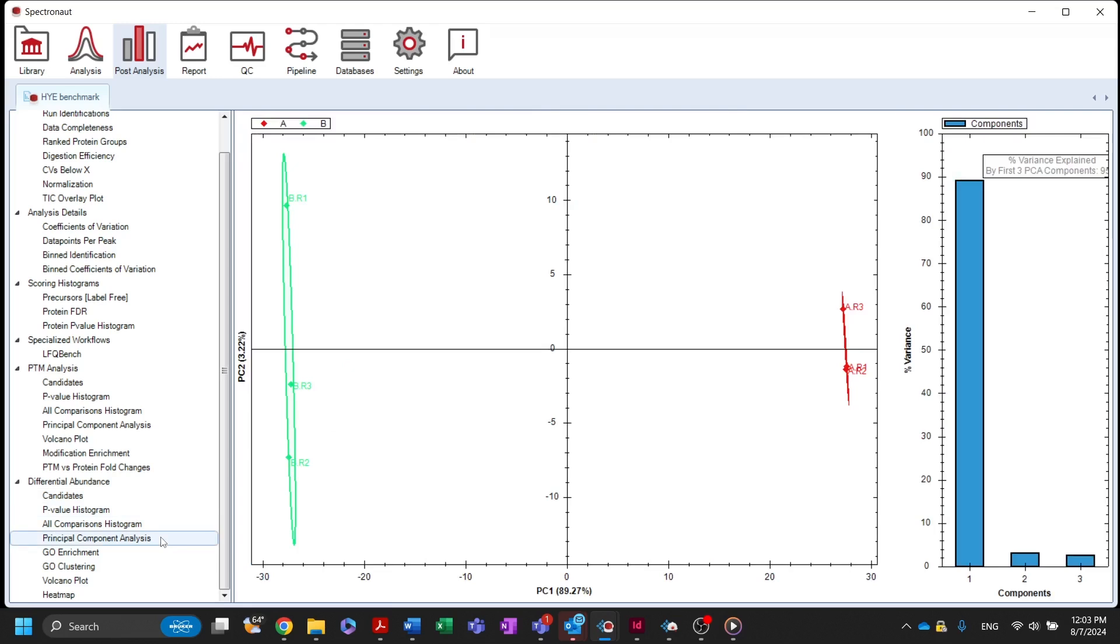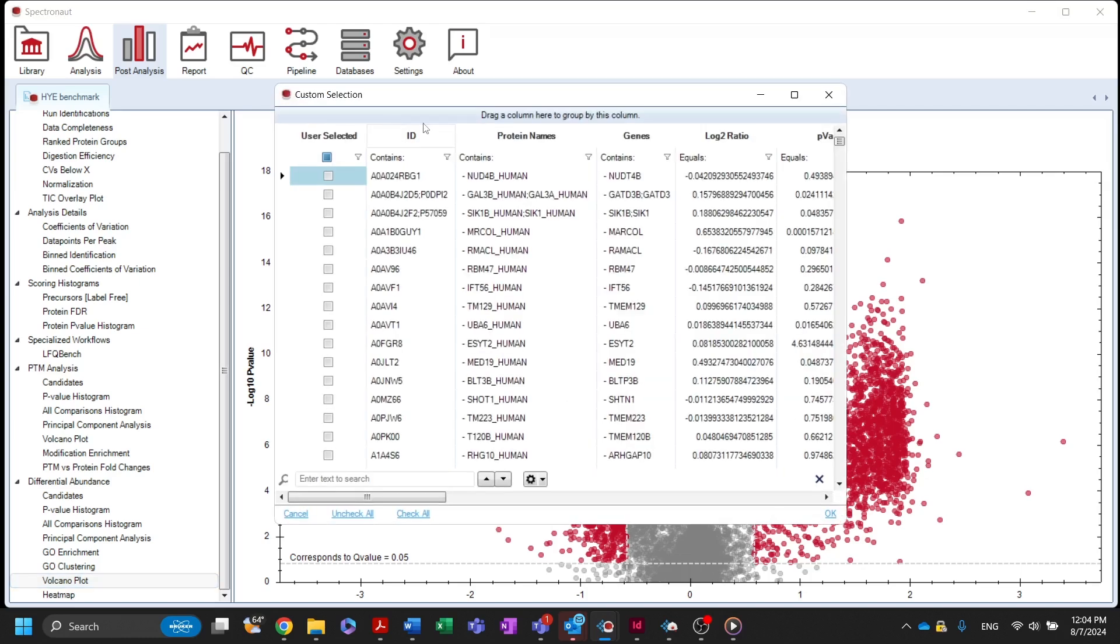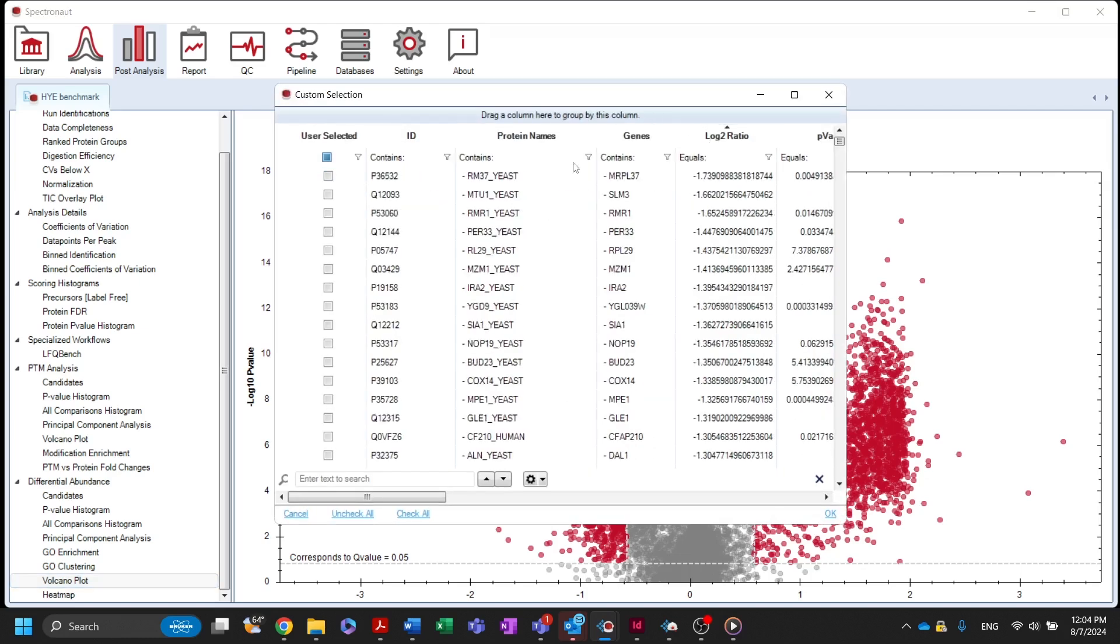The volcano plot shows the results of the differential abundance test by plotting the log2 fold changes against the significance level. Candidates appear in red, and by selecting one of the boxes above the plot, you can display annotations for differential analysis candidates or a custom selection of proteins.